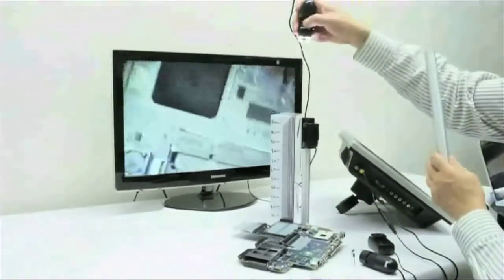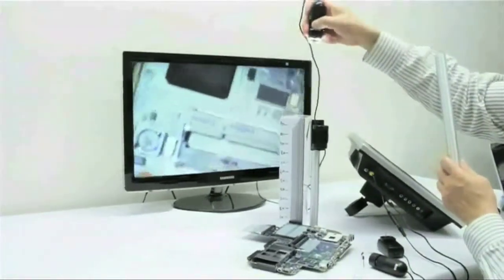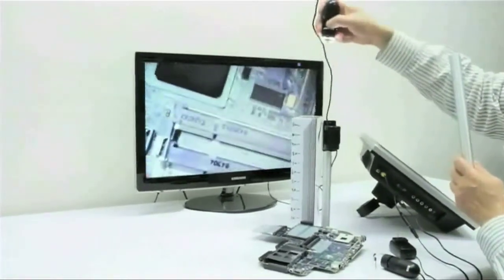Here you can see the unmatched versatility of our Dynolite microscopes.